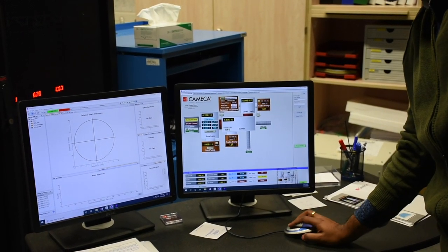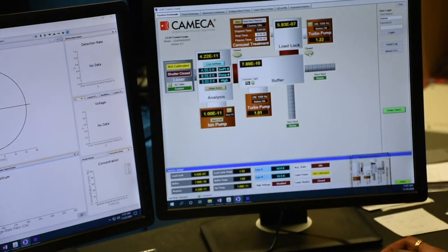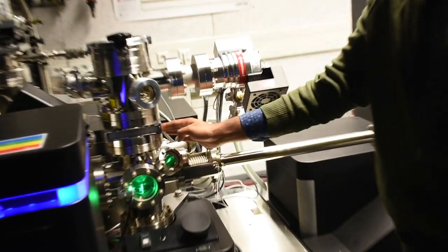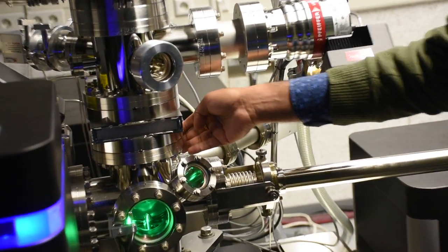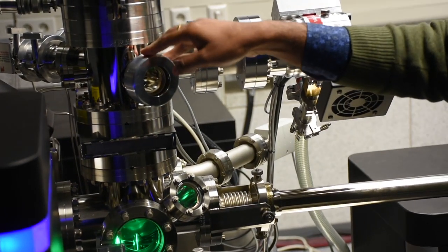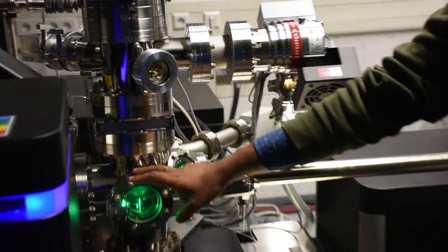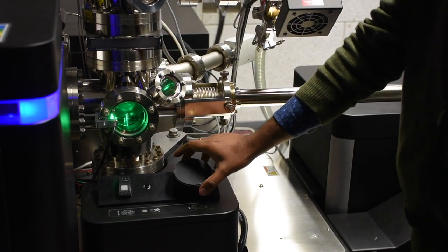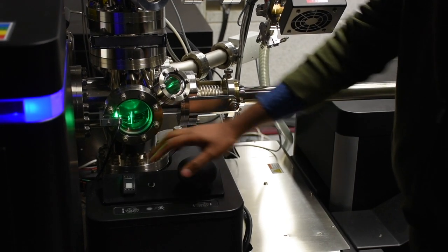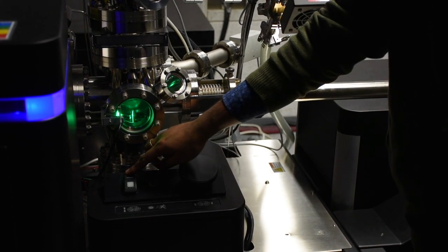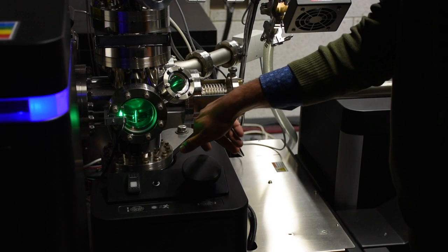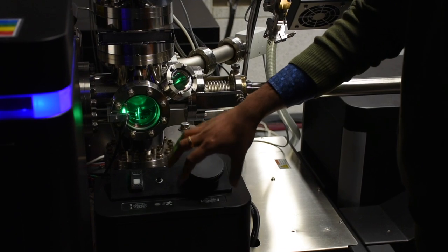Since the pressure is good enough in our load lock, we just open the valve from here, which opens the valve between our load lock and our buffer chamber. To move the carousel which is in our load lock to the buffer chamber, we have to use a vertical manipulation rod. This button is used to move the manipulation rod up and down, and this button is used to rotate the manipulation rod itself.